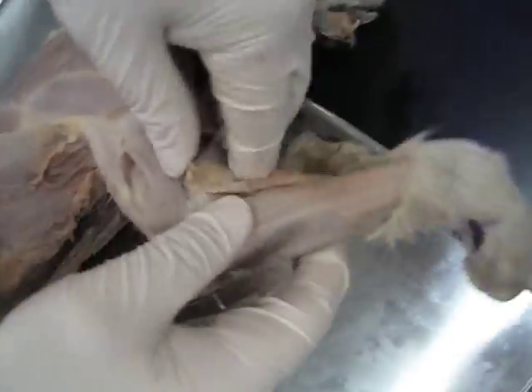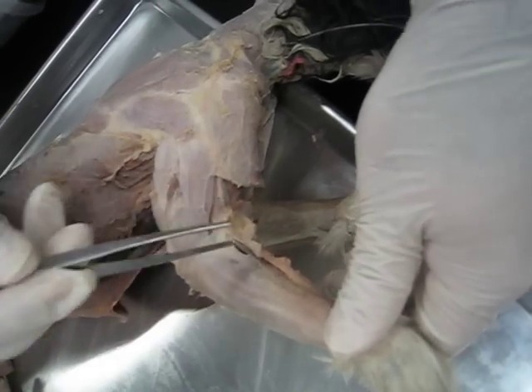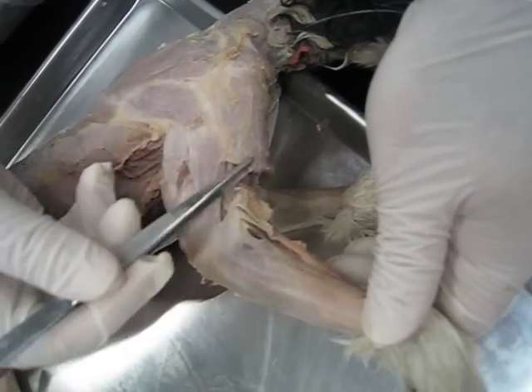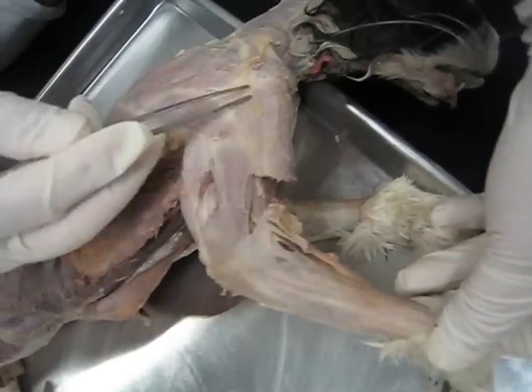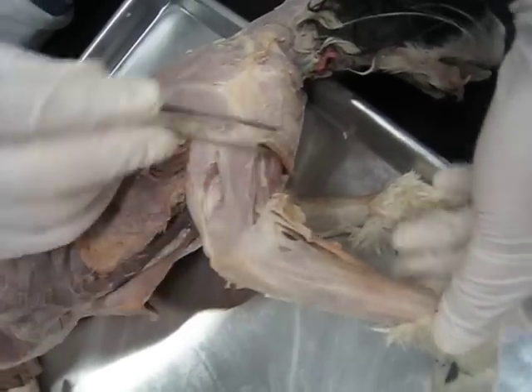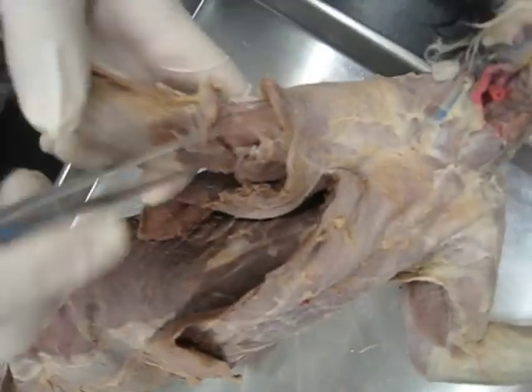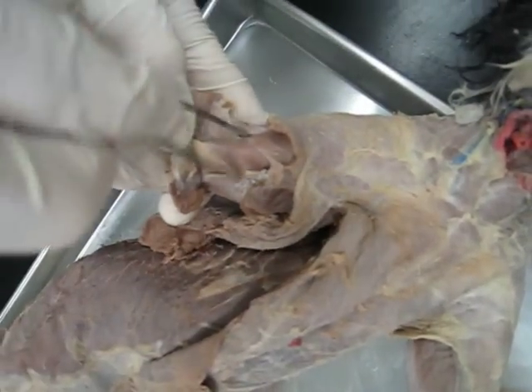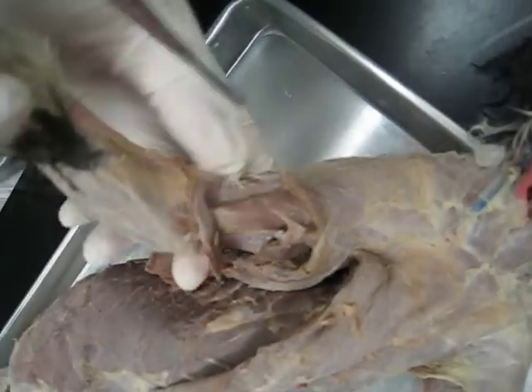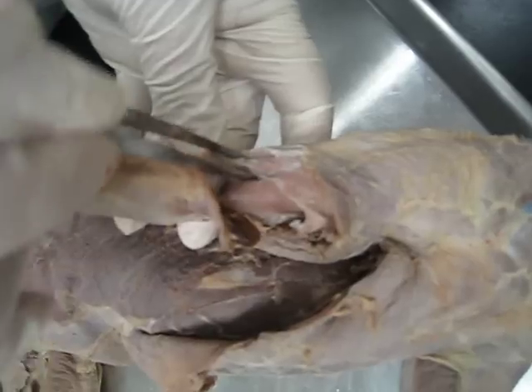If I turn this around, this is basically the continuation of that clavobrachial tissue, the clavobrachialis muscle. When we open this, inside we can see the biceps brachii. Right next to biceps brachii, we can see the brachialis muscle.